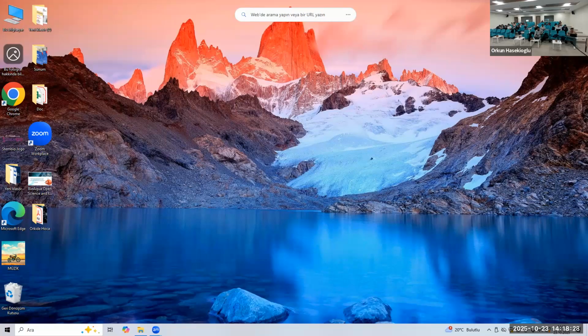You can rewrite it and rename it again REC, and it will replace the file that you had in your folder. Let's replace it.